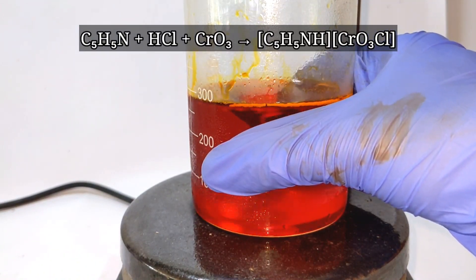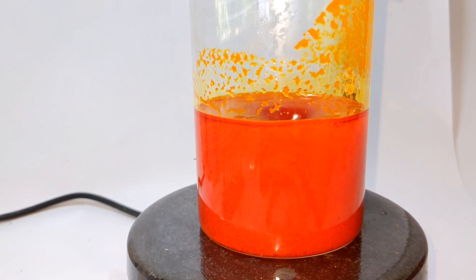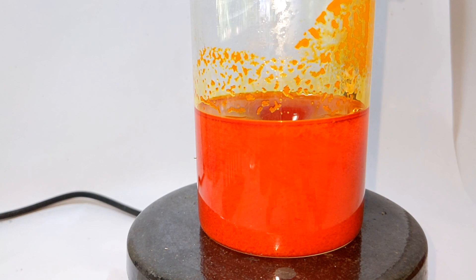This addition is exothermic and the heat of the reaction causes the crystals to redissolve, resulting in a deep orange solution. After complete addition of pyridine, the beaker was allowed to cool down, causing some of the crystals to precipitate out.